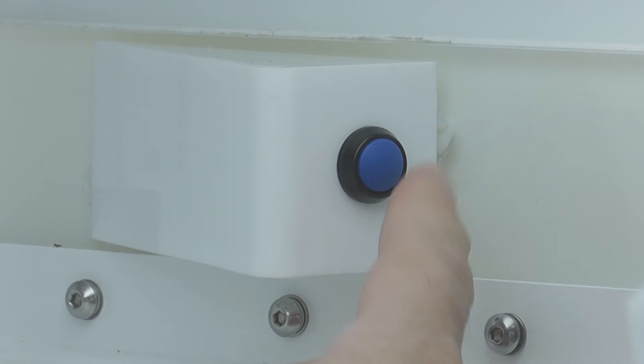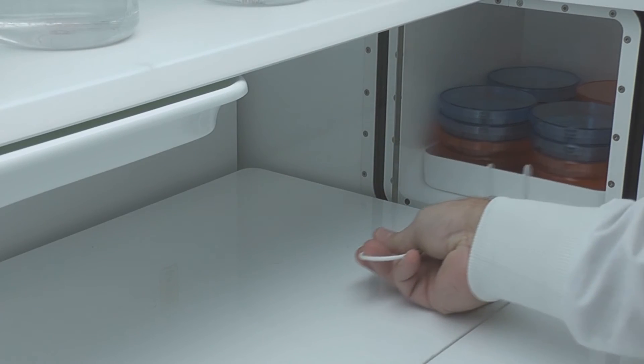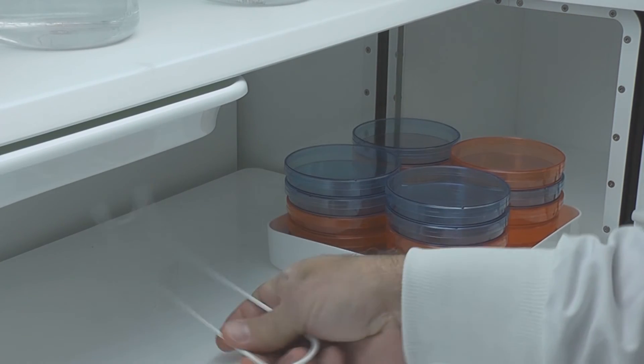Depress the blue button from within the workstation to open the inner door. Using the hook, pull the tray from the airlock into the workstation.